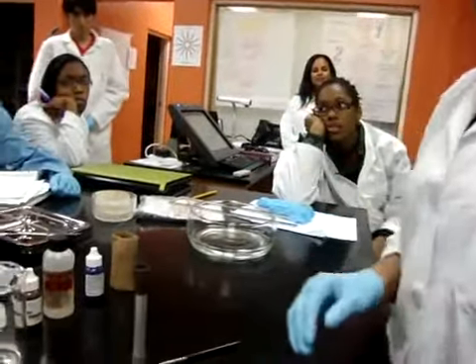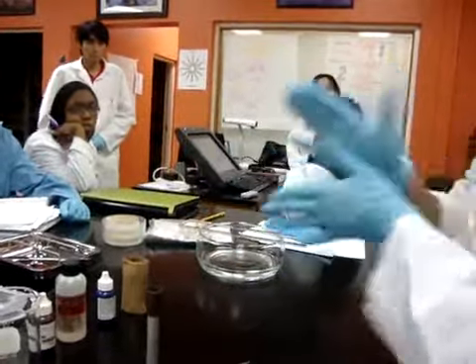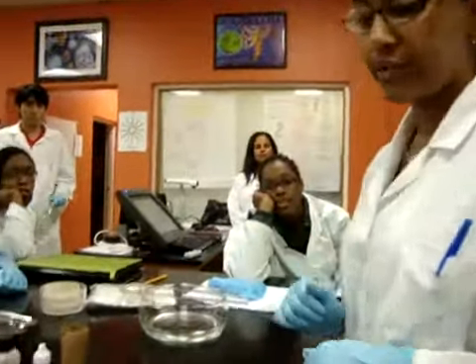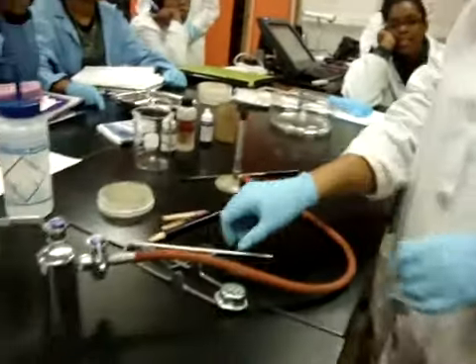And today is one of those days where that scrub for at least 15 seconds comes in. So when you have the soap on, scrub for at least 15 seconds before you wash off.